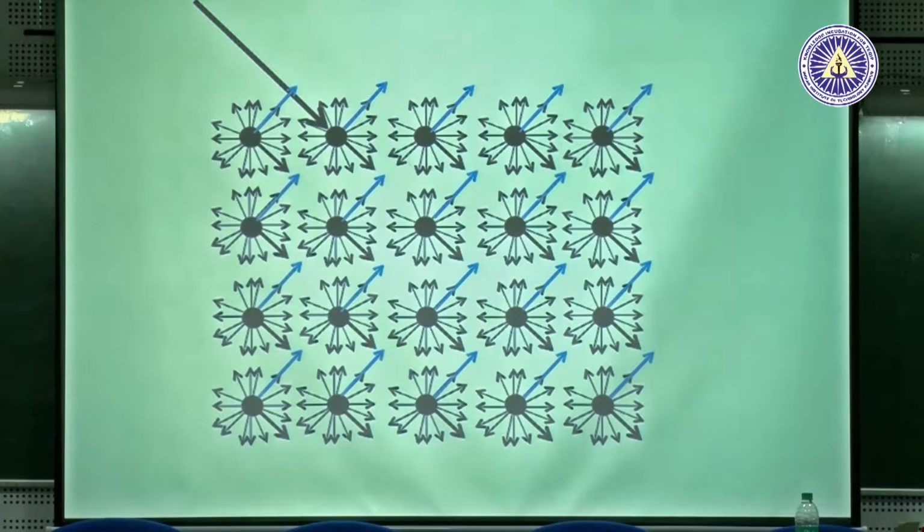So, you can apply the path difference, the phase difference rule and see whether you get addition or cancellation. If you have an addition, then you have a strong beam. So, by this longer arrow, I am saying that all these waves get added up to give you a strong beam. They could have cancelled also, that depends upon the phase difference. If they are in phase, they will add, if they are out of phase, they will subtract and so on. So, if they were all in phase, you will get a strong beam, and that is what we will then call the diffracted beam.